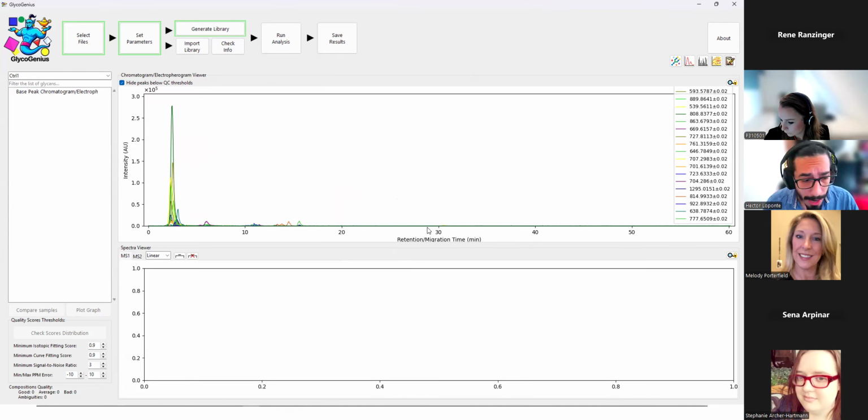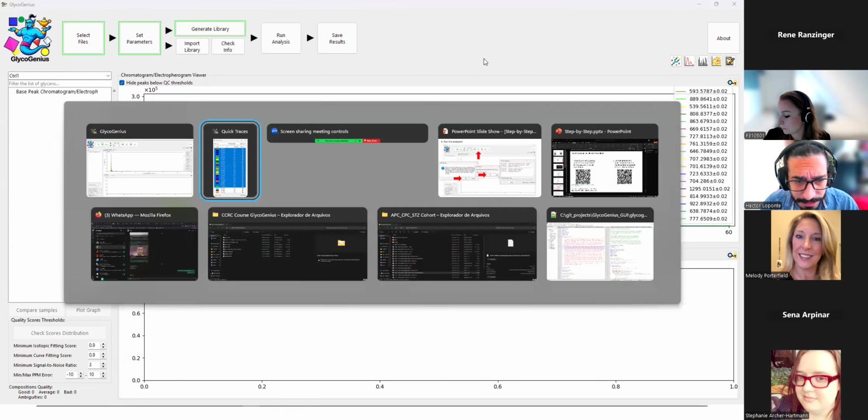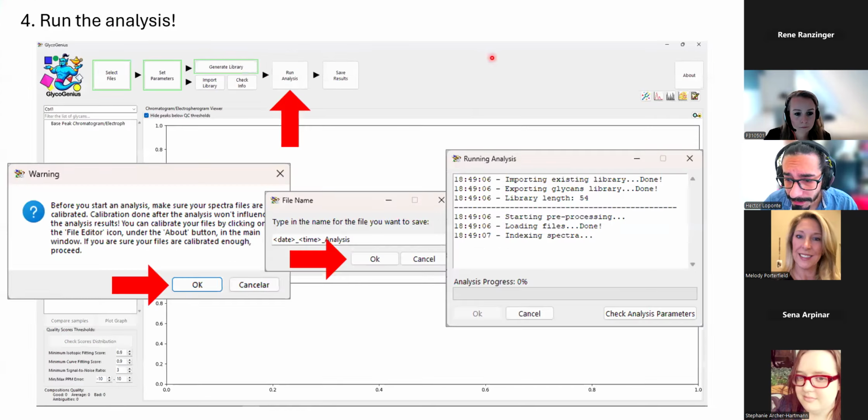So I imagine that by now your analysis should be close to finished. At least on my computer, it's done. Yeah, the more CPU threads you have, the faster it will be. It can use up to 64 threads. My computer has 12 threads, and it takes roughly 5 to 6 minutes to run, for example. So I think I can move on.